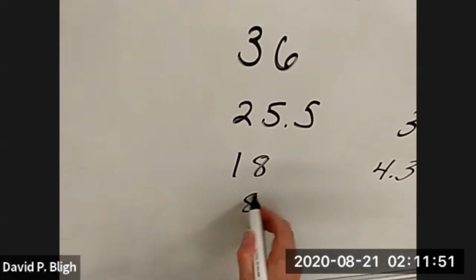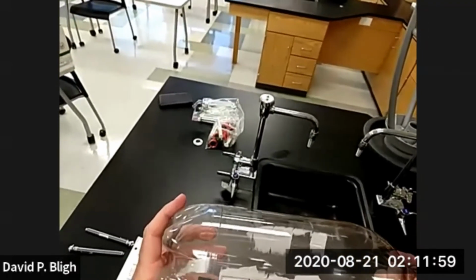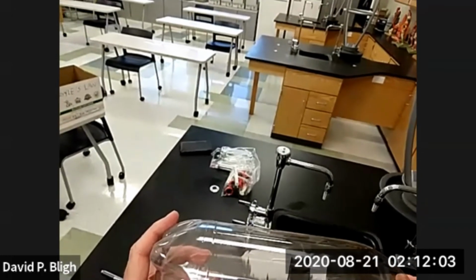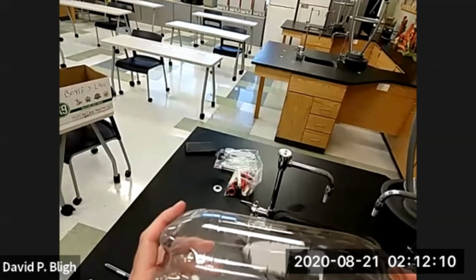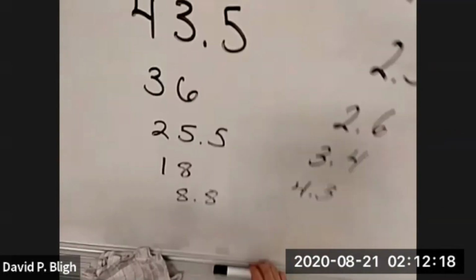So it went down quite a bit with that last one. See what volume that represents. It looks like we're sitting right on 5.7 milliliters.